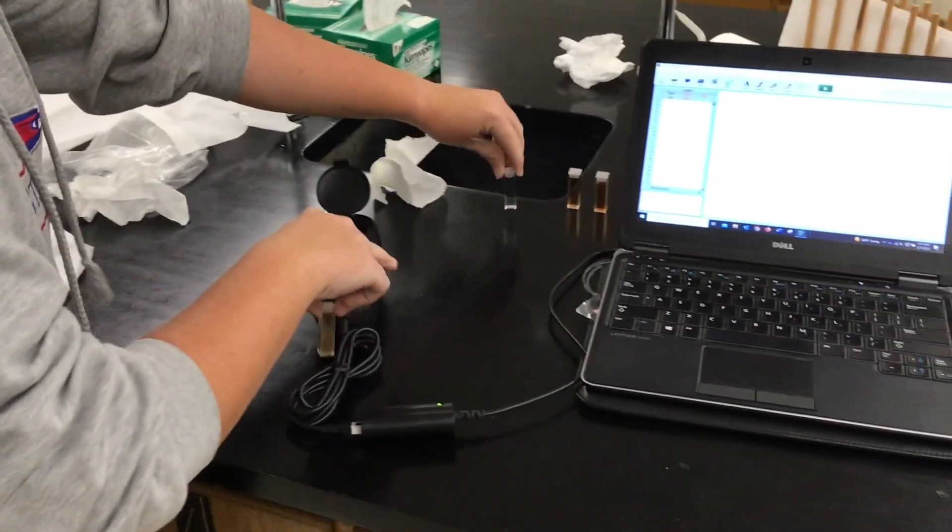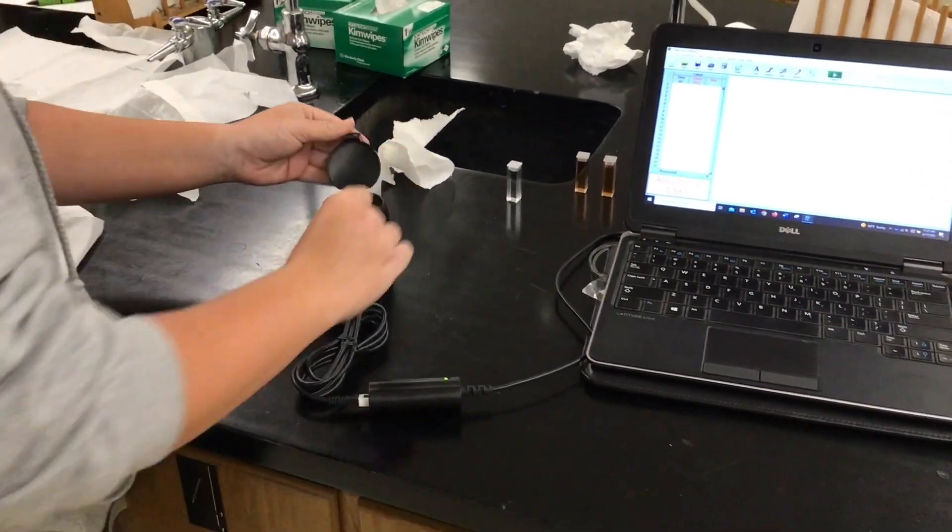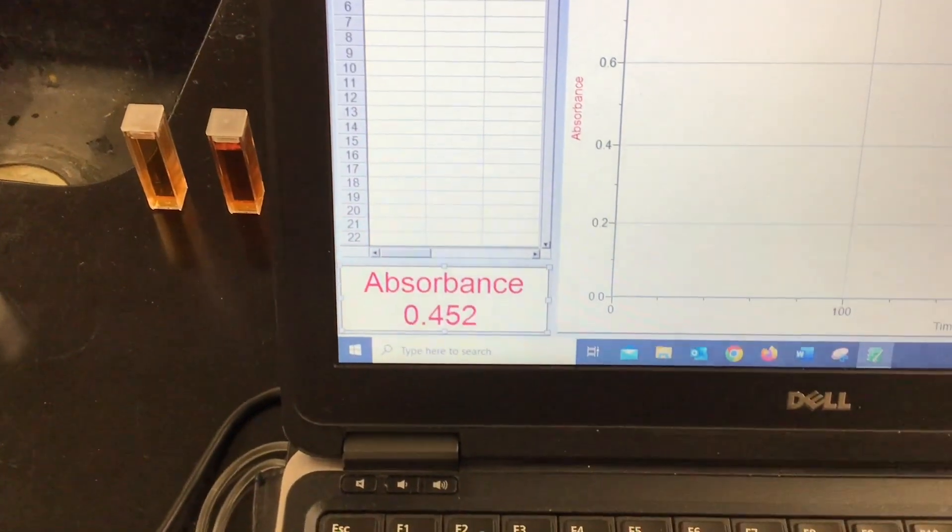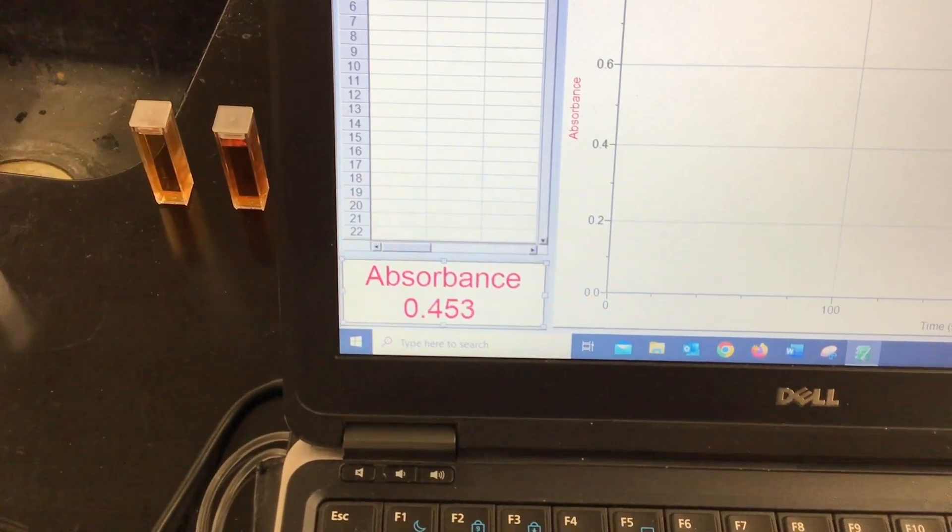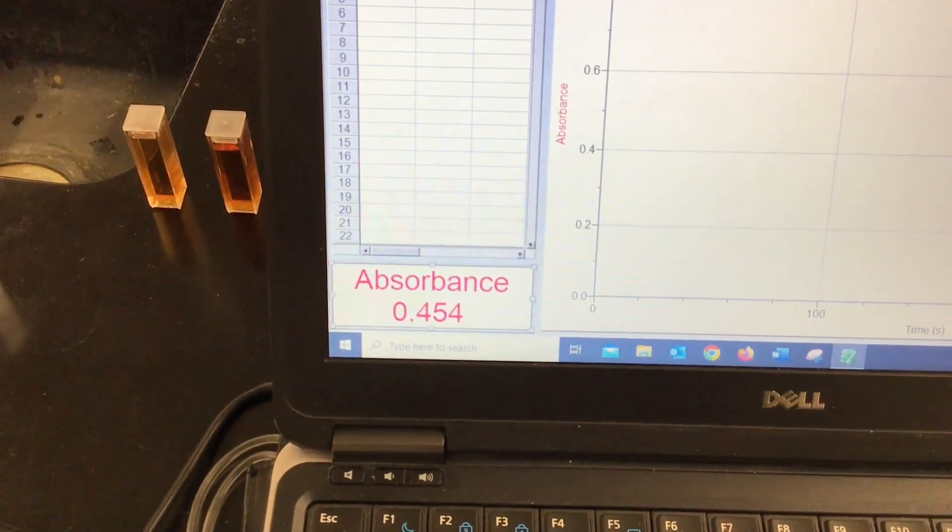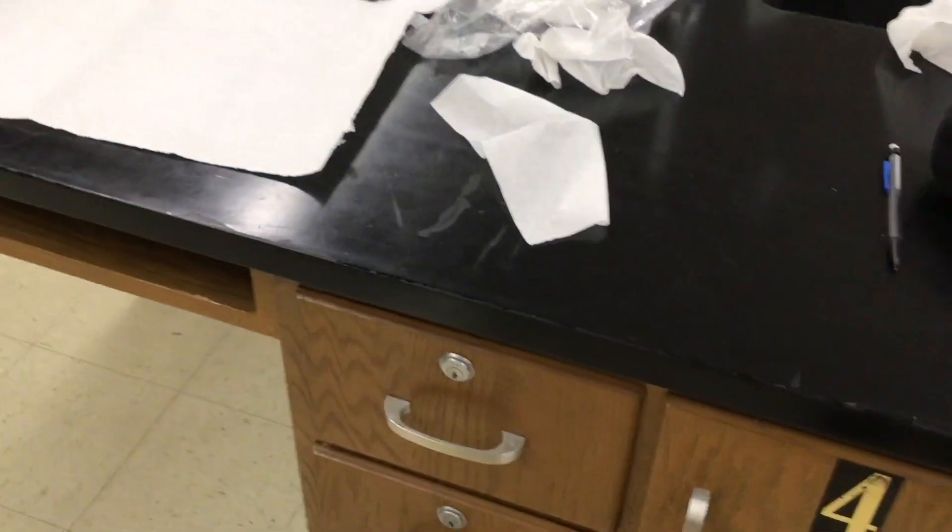Okay, we're measuring test tube three. We've done the preliminary in test tube five and test tube four. So this absorbance is moving 0.454. 0.454 absorbance and we'll get that data later.